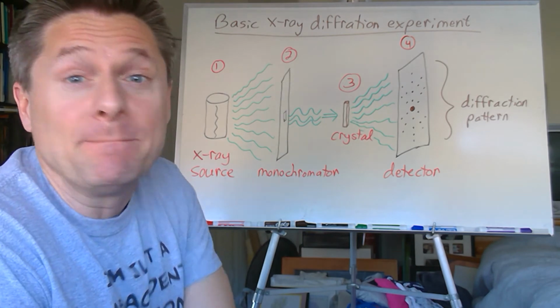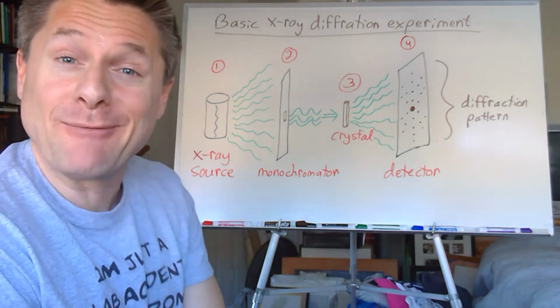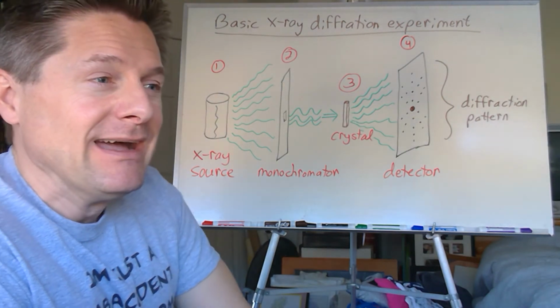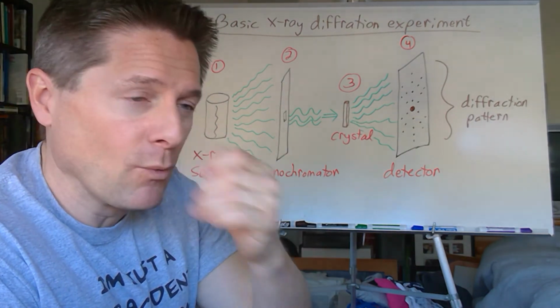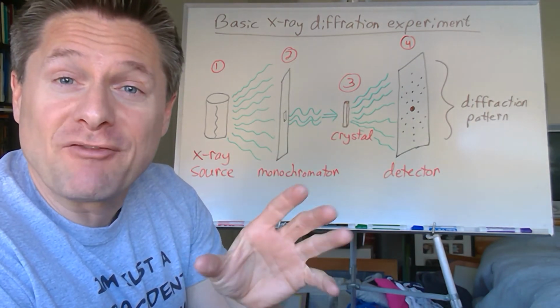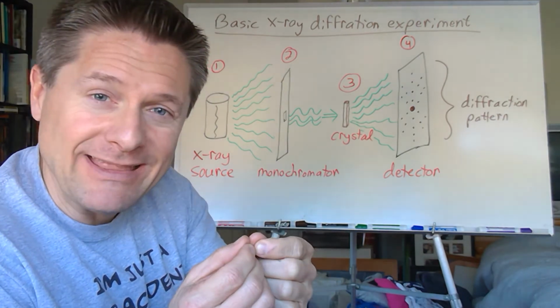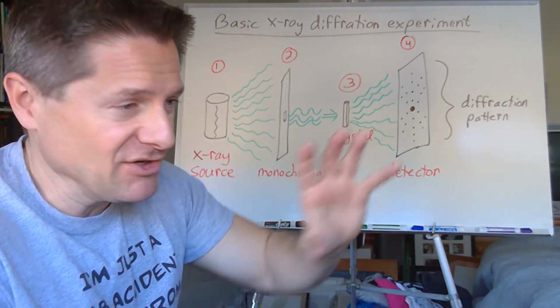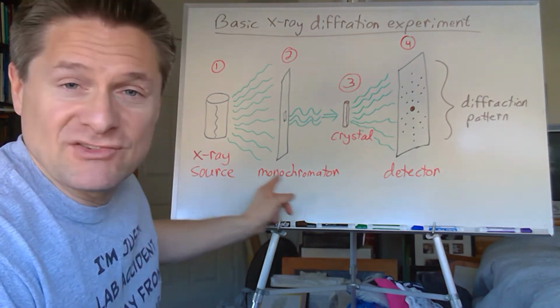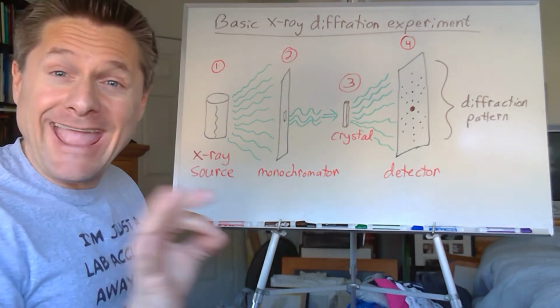I binged them, or you could Google them or Bing them, whatever weird verb we use now in today's technological world. So I saw a really cool one where a guy was going through doing an actual X-ray diffraction experiment. It was kind of neat. He had the little crystal in there. He mounted it in there. It had a covered X-ray source, showed where the X-ray tube was, and showed how you could rotate the crystal around. It was really neat how you could change the angle of incidence.